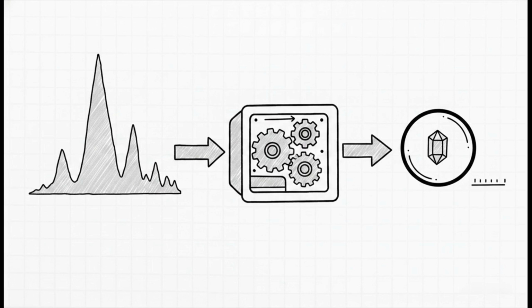Beta is the really crucial part here. It's that FWHM, the width of the peak we just talked about, measured in radians. Plug those numbers in, and you can legitimately calculate crystal sizes down to the nanometer.